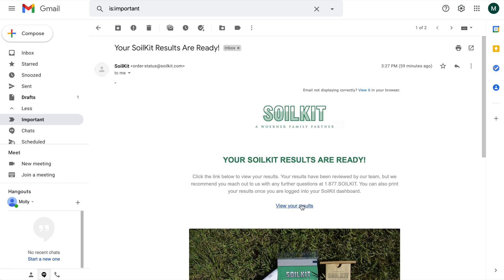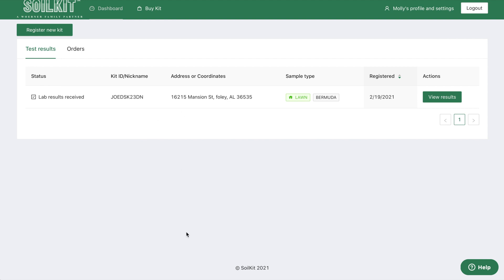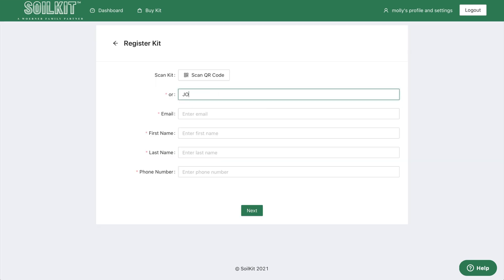The View My Results link will take you to SoilKit.com where you can log in to your dashboard. If you have an account, the system will prompt you to create one. If you have multiple tests, you will see a list of them.